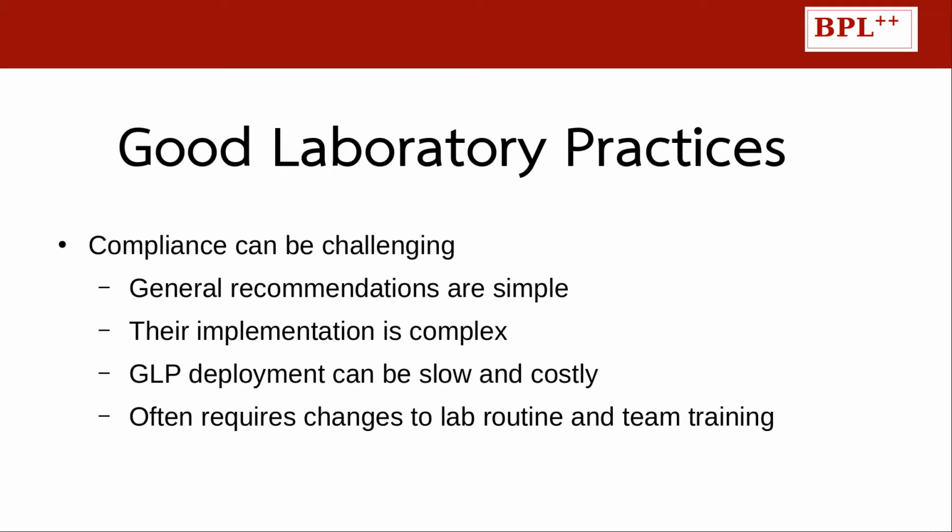However, GLP compliance can be challenging. Although general recommendations of the GLP principles are simple as a concept and easy to read, their implementation and recognition of the compliance of a laboratory are complex. It may require a deep understanding of all laboratory procedures and how they can be adapted to GLP. Because of this, it is common for GLP deployment to be slow and costly, potentially requiring changes to laboratory routine and team training.